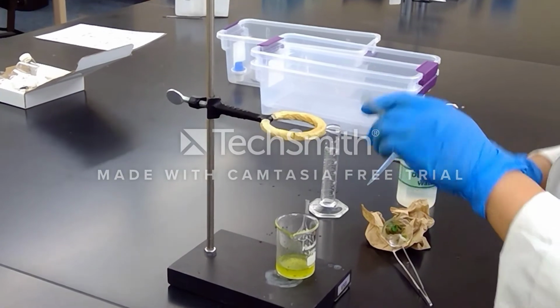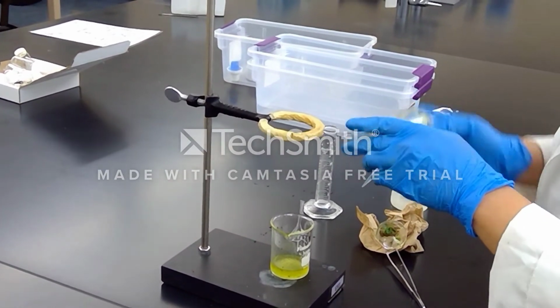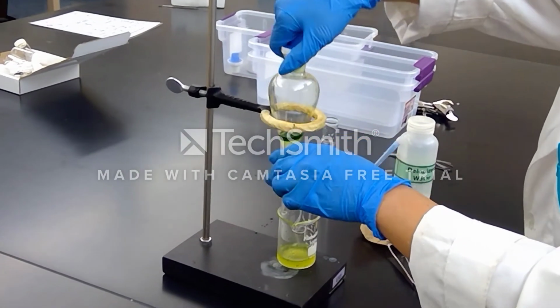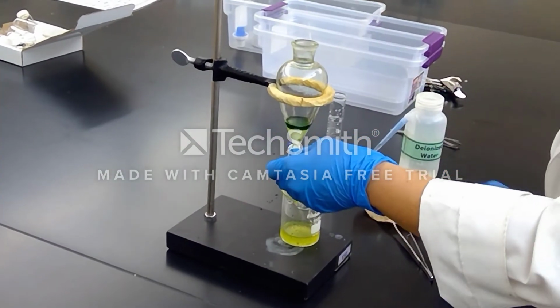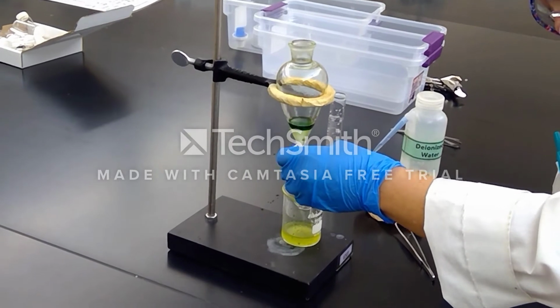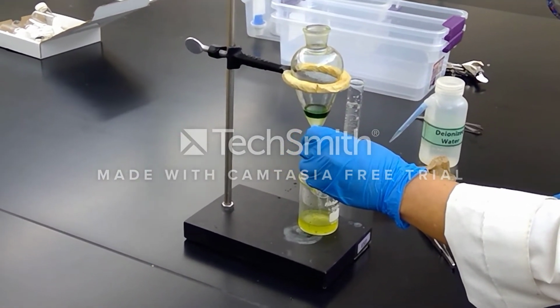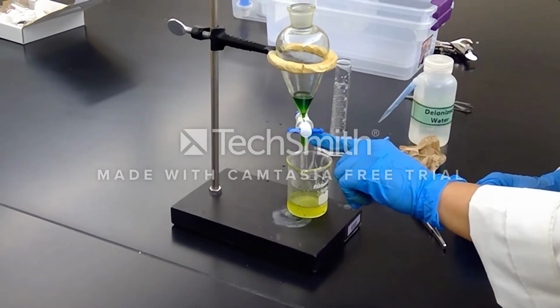More venting is required. There we go. And in the second round, there's not as much gas being released, and that's totally fine. Okay, so again, I'm letting out the lower aqueous layer. And if you notice, this time the aqueous layer is even more clear than the first portion. Got a little bit to the other side here, and that's okay.